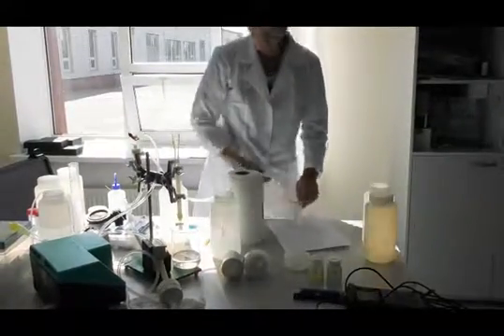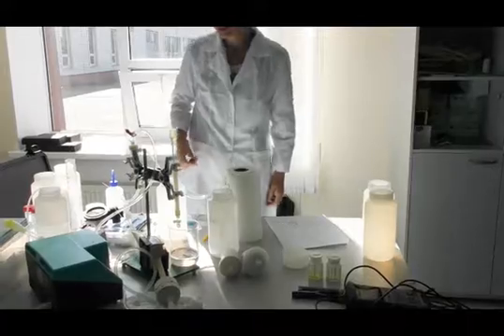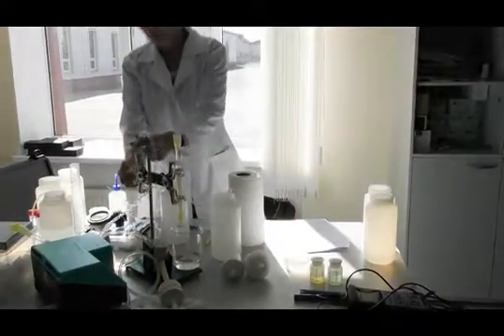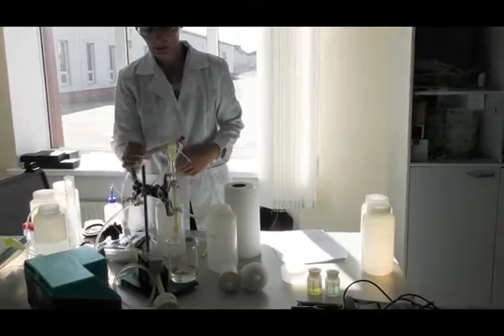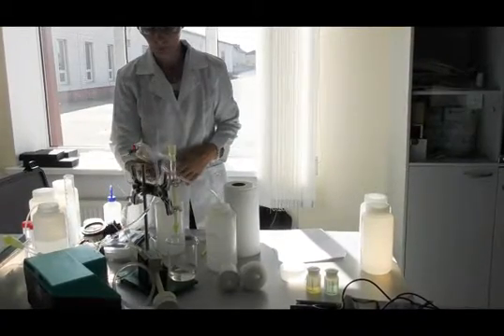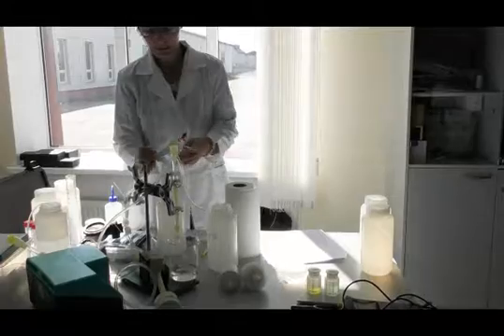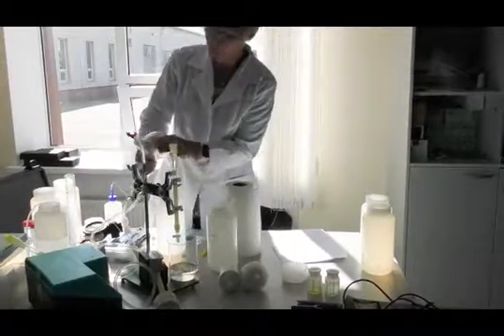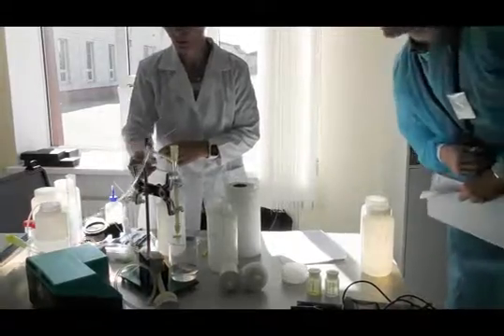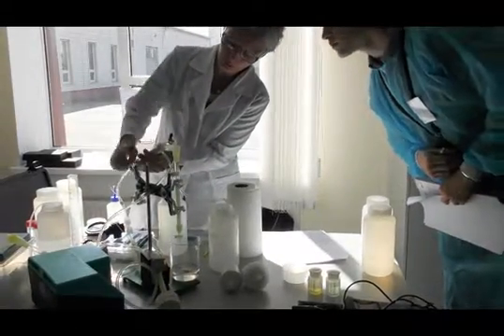We can keep on with the hollow fiber. There are a lot of different systems for ultrafiltration, but this is a hollow fiber for ultrafiltration. That means it's a filter with a lot of tubes inside. I don't know if you can see that. It's a small filter. You see all the tubes?